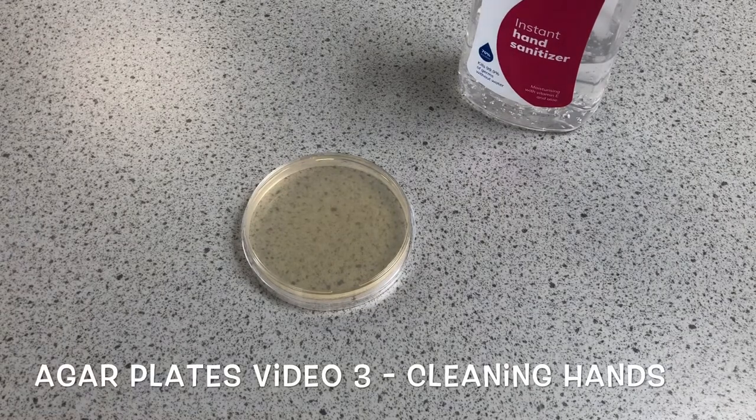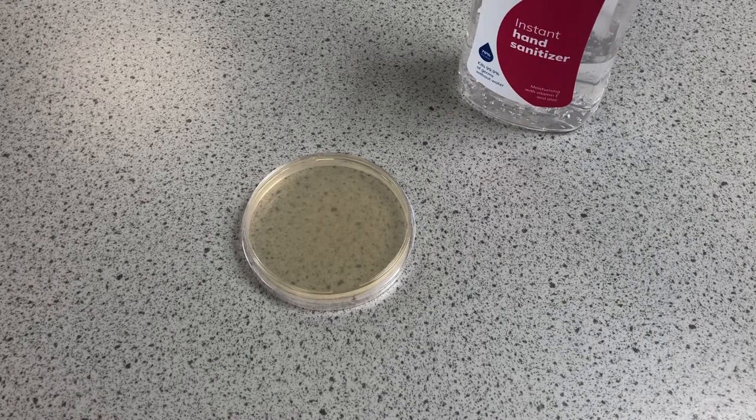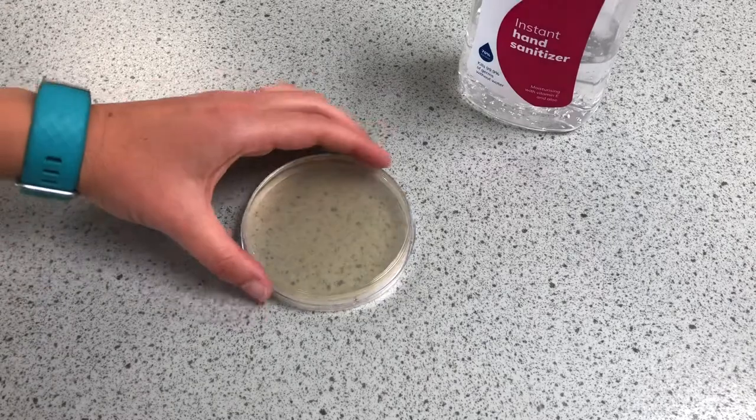This is the third video in a series from topic B1 cell biology, looking at the triple science practical using agar plates and sterile technique, also known as aseptic technique. This one we're going to look at the question: is hand sanitizer better than washing your hands?